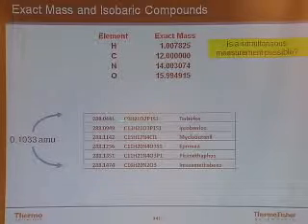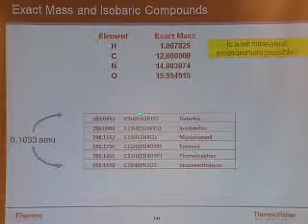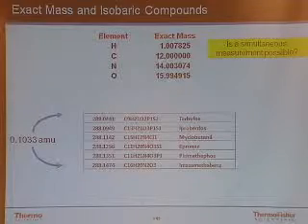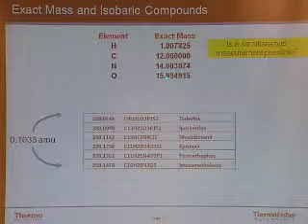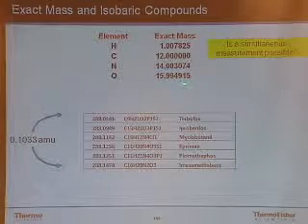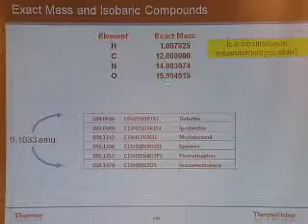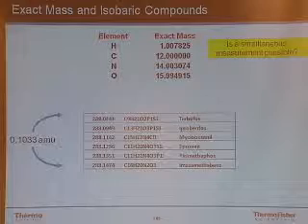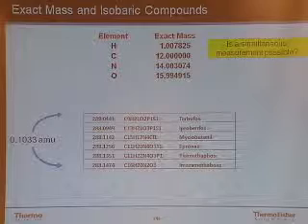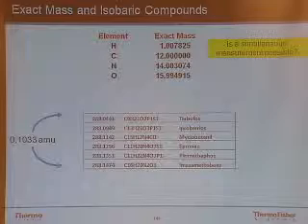Well, I simply take the 9 carbons, and there's the true accurate atomic weight of carbon, and the same thing for hydrogen, and the same thing for nitrogen and oxygen. Now notice with atomic weights you actually have 6 decimal places of accuracy to work with. Okay? And that's well known and well characterized. So now what we're saying is that experimental mass spectrometry is coming within 1 part per million of the same accurate result. So let me show you what happens.